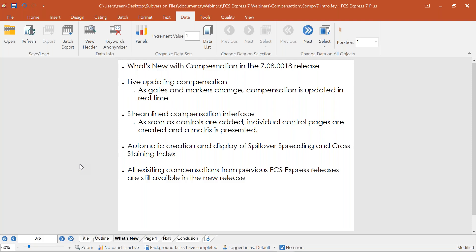The spillover spreading matrix and the cross-staining index are two new metrics in FCS Express provided when you do automatic compensation. These are items folks have asked for for quite a while, and they're now here and accessible in this release. Also keep in mind that all existing compensations from previous FCS Express releases — all the layouts you've been using — you don't have to recreate everything; you can bring those layouts and data in and pick up where you left off.